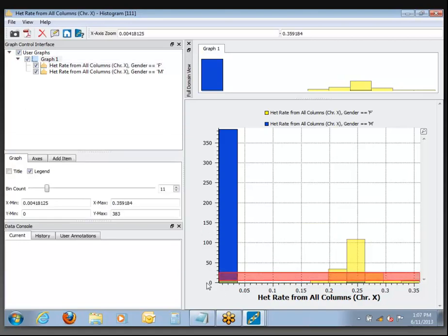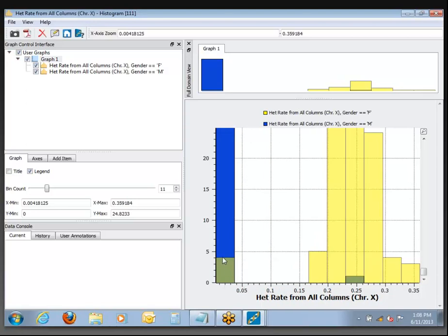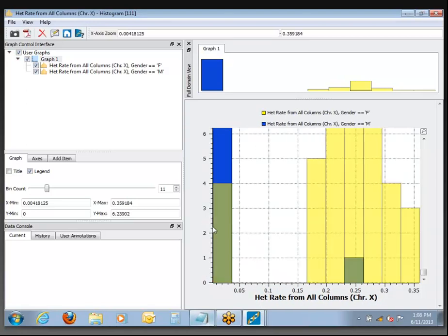You can zoom in on any plot by clicking and dragging along the axis. I clicked at about 30 and dragged down. I can get an idea of the actual count — it looks like there are four samples in this zone that were mistakenly labeled female, and it looks like one up here that was mistakenly labeled male.